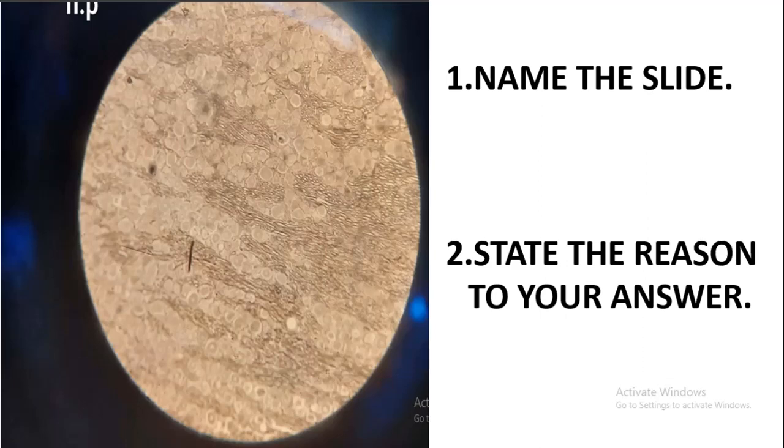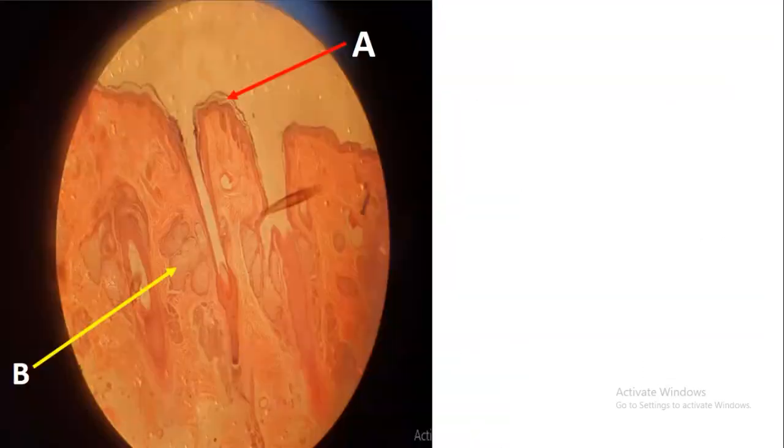You can say a lot of nerve bodies, because a ganglion has a lot of nerve bodies in it. So in this case, the sensory ganglion is just showing numerous nerve bodies, and these nerve bodies are being surrounded by dark stained satellite cells. So that's the answer there.